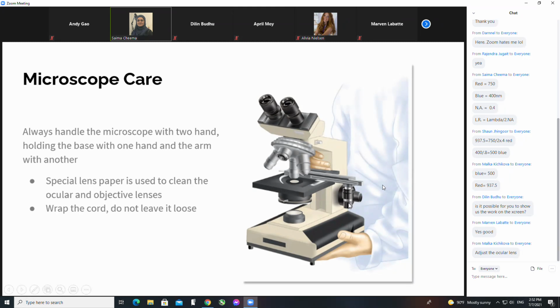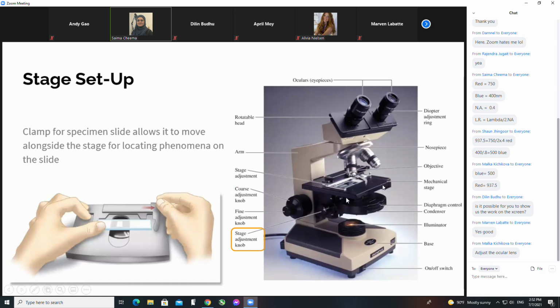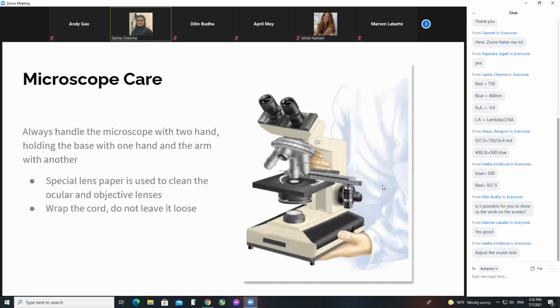So there are, notice here's a different kind. This is what I'm used to seeing, and that's why I was kind of thrown off a little bit. This looks a little bit like what some microscopes have to remove the diaphragm mechanism and clean it, and so I thought it looked like that. But the ones that we would have in person, if we were to do this lab, were similar to this. So the knobs are a little bit different and located in different places.